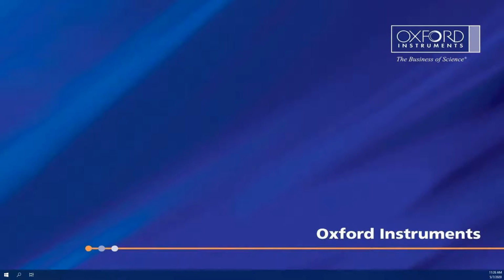Okay, and then can it take care of the dimmer region at the junction of the images that need to be stitched, which is generally found after stitching? Yeah. So the dimmer region at the junction of images like that is often caused by uneven illumination. So that's often more of an acquisition side, an optics side of things. So it's not something that we correct for at this time, but this is definitely a very interesting feature request for us to consider.